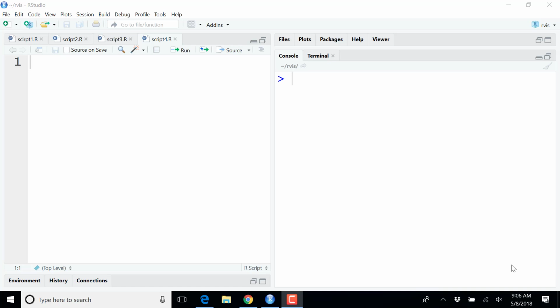So today we are going to start with the section called Tools and Plots. On the program, we will explore some data transformations, learn about plots that we can use to compare samples, such as scatter plots, and use linear modeling to model the relationship between two samples. Then we'll have a section on statistical plots: what kind of plots can we use to visualize the results of our hypothesis testing.